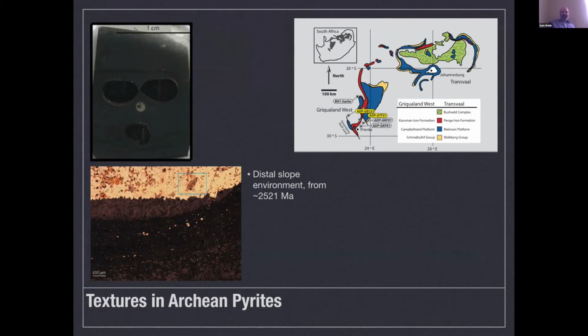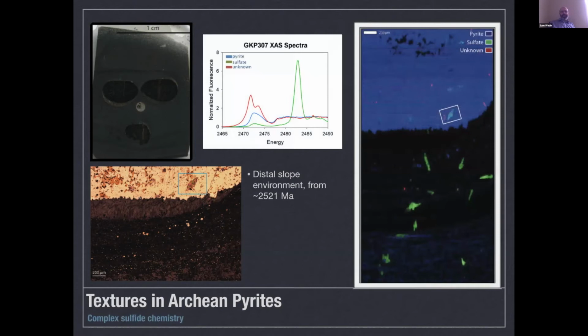So I'm going to draw your attention to this region here, and this compaction rim, the pyrite and the shale here. By looking at the spectroscopy and putting together an image map, you can see that there's pyrite, which is a very good sign, noted in blue here. You can see some smaller pyrite crystallites on the outside here next to this big deposit, precipitate. And there are these lath-sized little sulfates that go through here. It's a very typical sulfate signature.